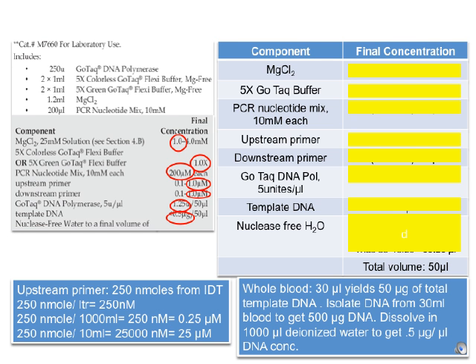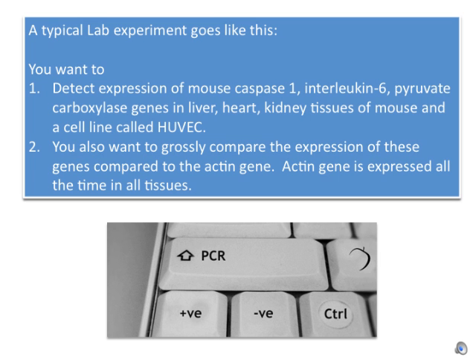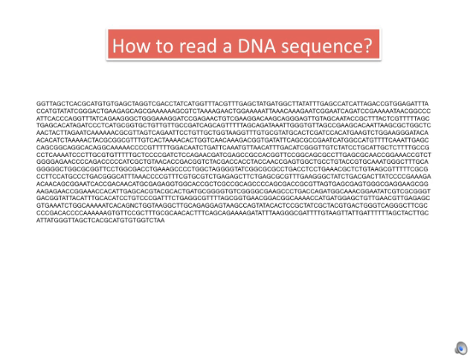Of course, typical PCRs may involve multiple genes and multiple tissues. You will also account for various controls. At the workshop, you will learn to design such complex experiments.